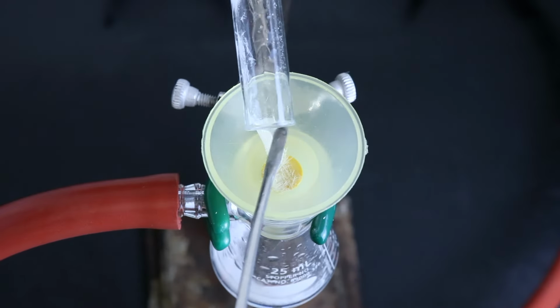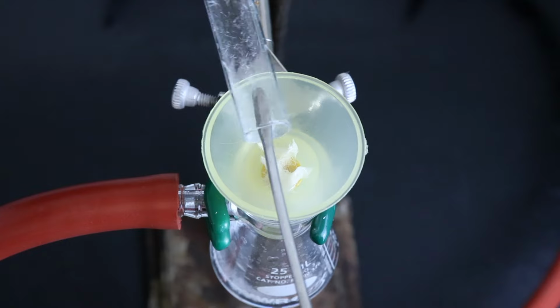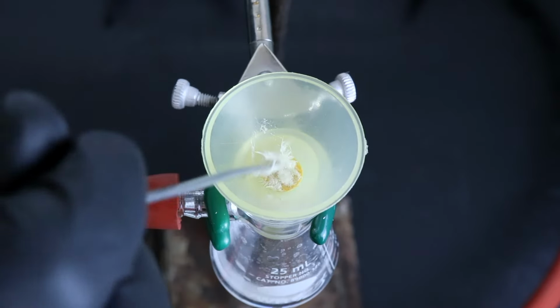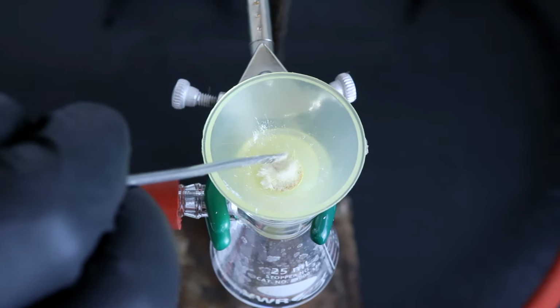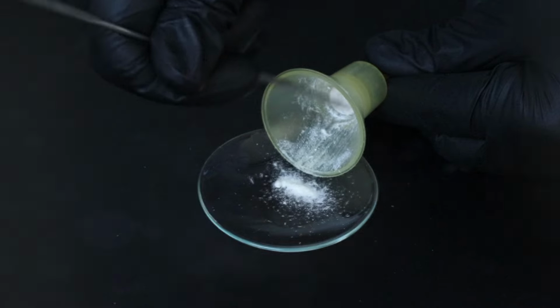I'll remove those crystals using vacuum filtration and rinse the crystals using some ice cold water, being very careful because obviously this acid is pretty soluble in water. And I'll stir them around on the Hirsch funnel to make sure they're nice and dry. Once dry, I'll remove the crystals from the Hirsch funnel and see where they melt.